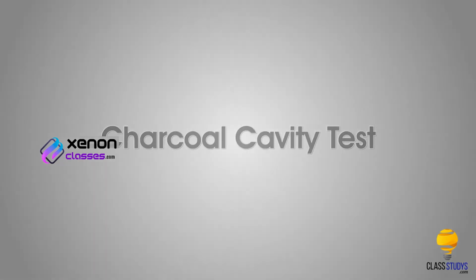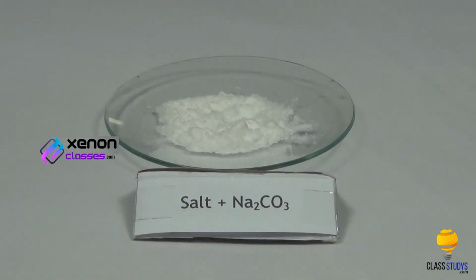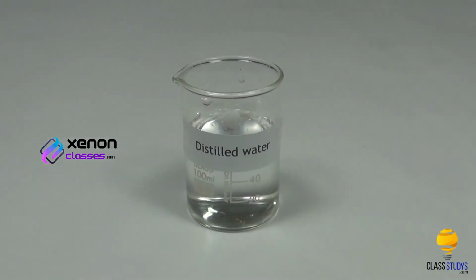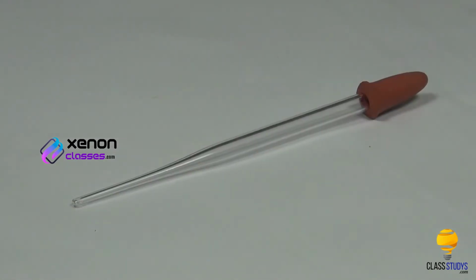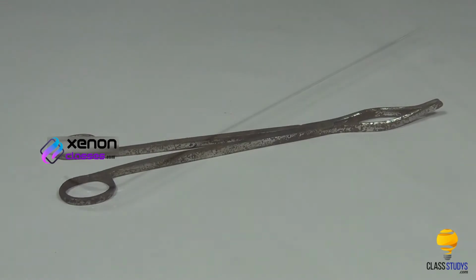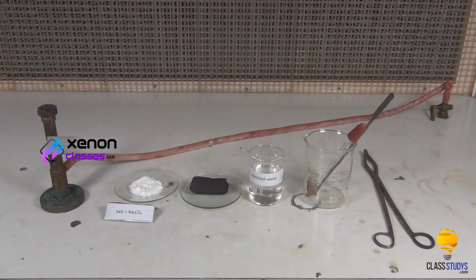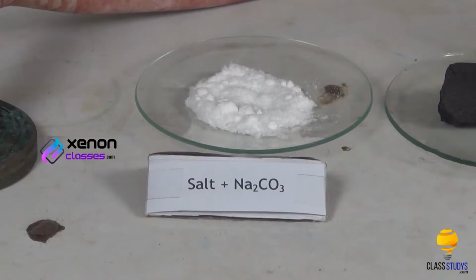Charcoal cavity test. Materials required: mixture of salt and sodium carbonate in a watch glass, charcoal piece, distilled water, spatula, dropper, tongs, blowpipe, and Bunsen burner. Procedure: take a mixture of small quantity of salt and double its quantity of sodium carbonate in a watch glass.